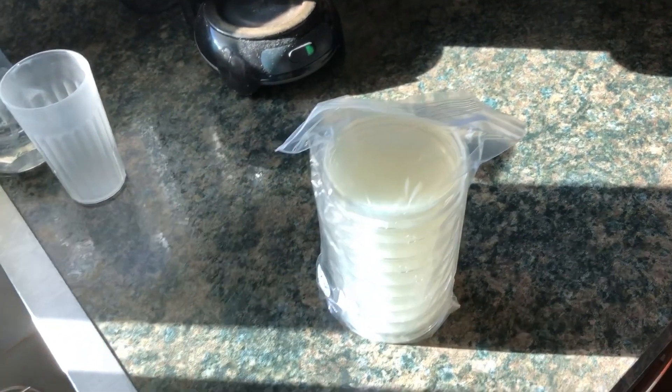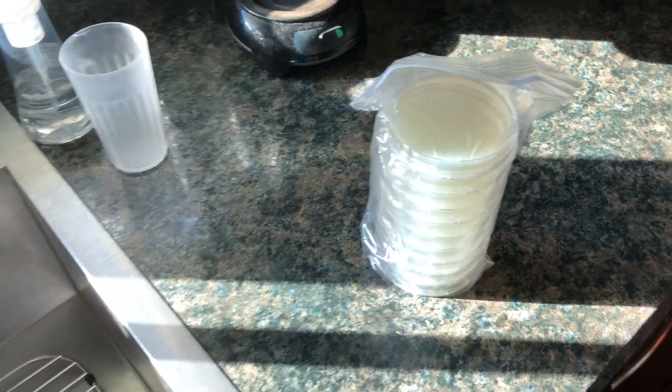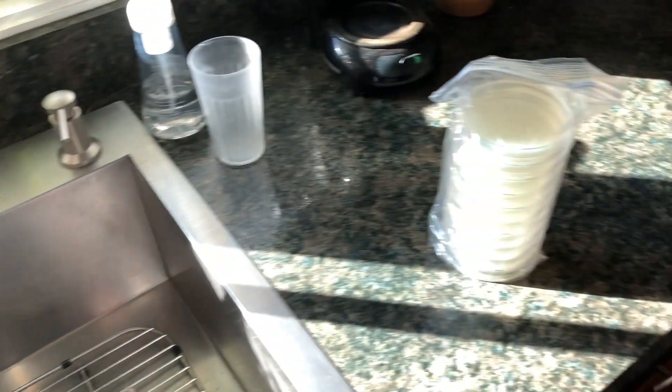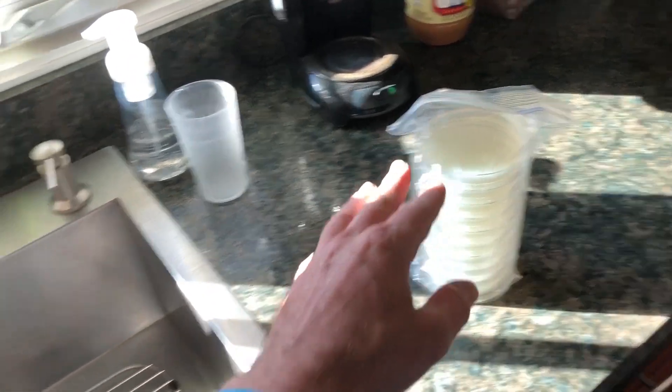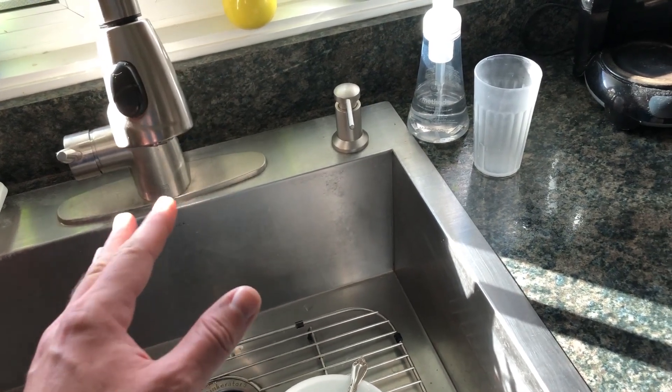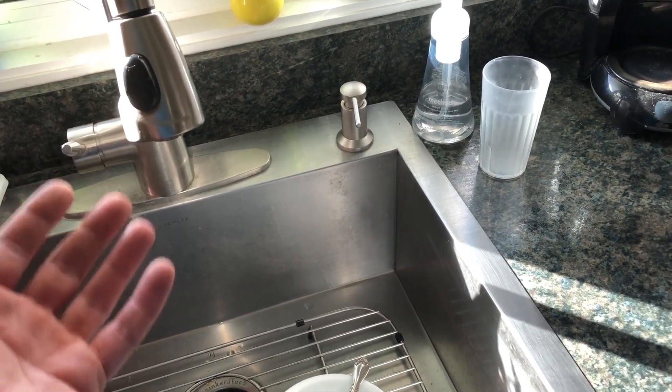I've got my nutrient agar plates here — 10 of them. For this experiment, we're going to do something pretty simple. First, we're going to take one of these plates and put some tap water on it, just as a control to make sure there's no bacteria in the water itself.